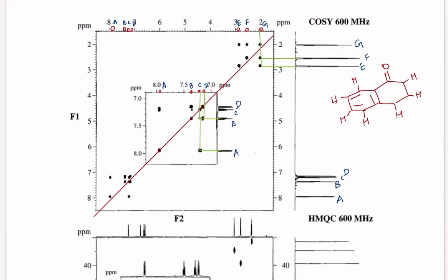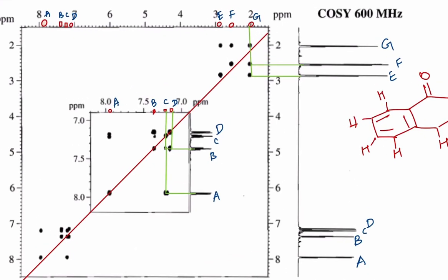Okay, so it's better to write the correlations here. So this is going to be correlation between F, G. I'll be consistent. So if I choose to write the letter from the y-axis, I'll put that in the front and then followed by the letter from the x-axis.